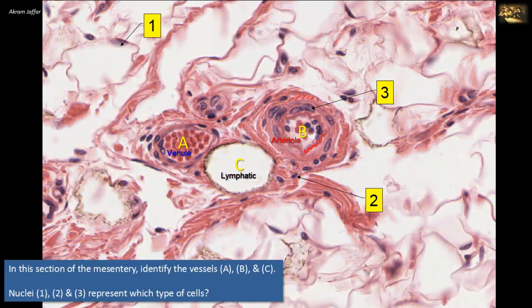Lymphatic vessels drain excess tissue fluid and return it back to the bloodstream. For the second part of the question, cell nucleus 1 belongs to an adipocyte. These are the cells which accumulate fat, and they are commonly found in the mesentery. These adipocytes are separated by fine partitions of connective tissue. You can see the single large fat droplet in the cytoplasm of the adipocyte. This pushes the remaining cytoplasm and the nucleus to one corner of the cell.